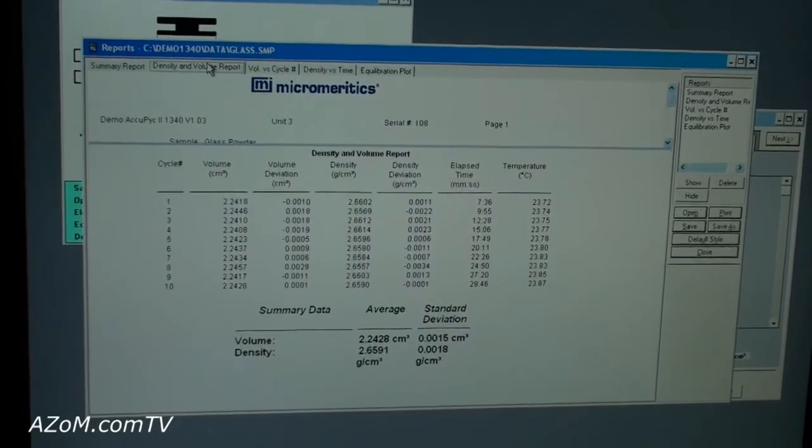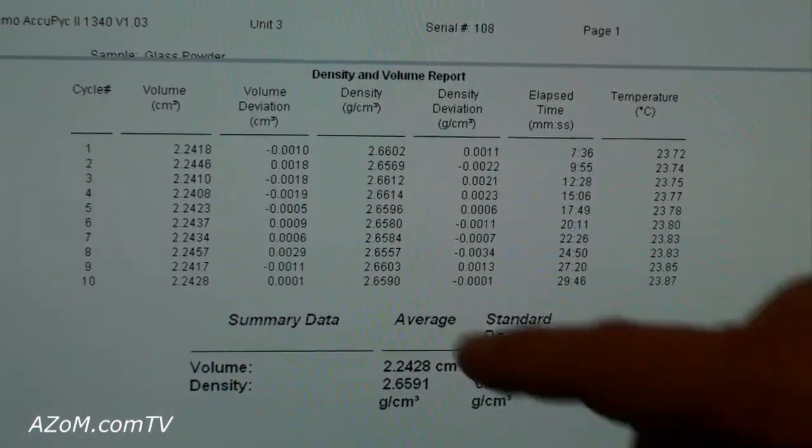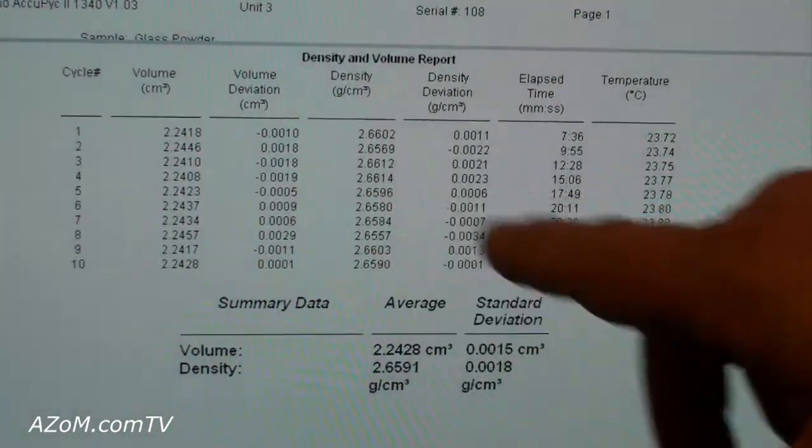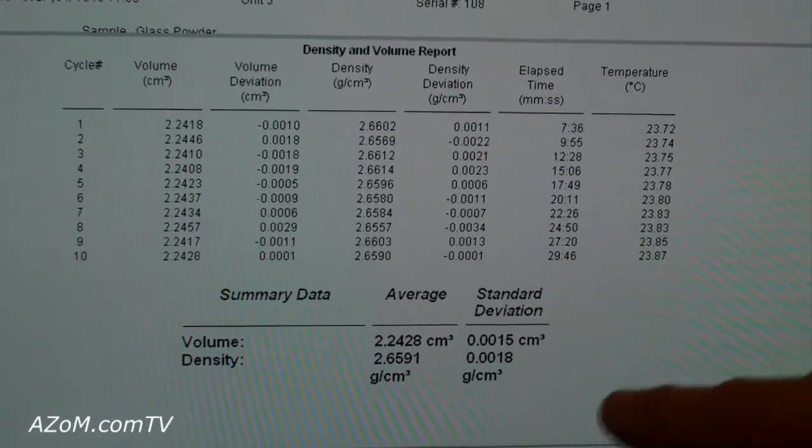If we looked at the number of tests in this case, there were 10 replicates done, where we looked at the volume and density and deviations for each of those tests, the elapsed time and the temperature. And again at the bottom, we are seeing the average volume and average density for those 10 replicate tests.